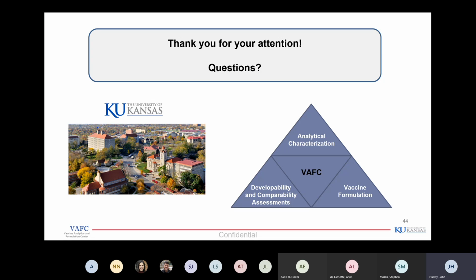Typically you have to do some tricks to get them into a gas state, either derivatize them or, if you're performing proteolysis, make it in such a way that you have some of the surface exposed, more MS-friendly parts of the molecule. But yes, that is one of the big challenges. And you see this a lot in the proteomics field, where soluble proteins are relatively easy to look at, but really the membrane-bound proteins are a big challenge.